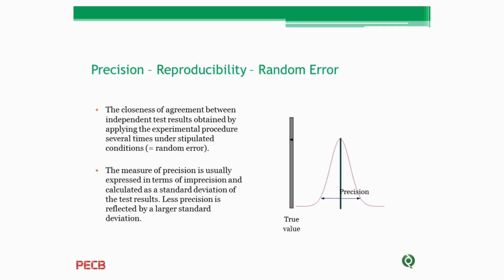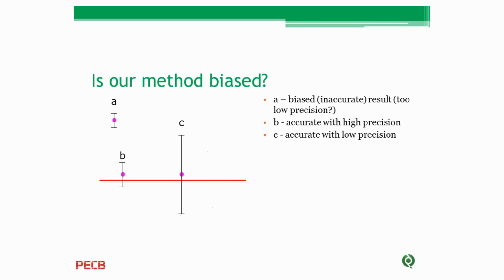So in precision, as I mentioned, both of these features should be monitored. When you want to plan your quality control activities in your laboratory, you should keep in mind that precision in terms of repeatability and reproducibility should be checked, and also your systematic error or your bias should be checked. Different means are available. For example, proficiency testing is a tool for checking your bias or systematic error within your laboratory.